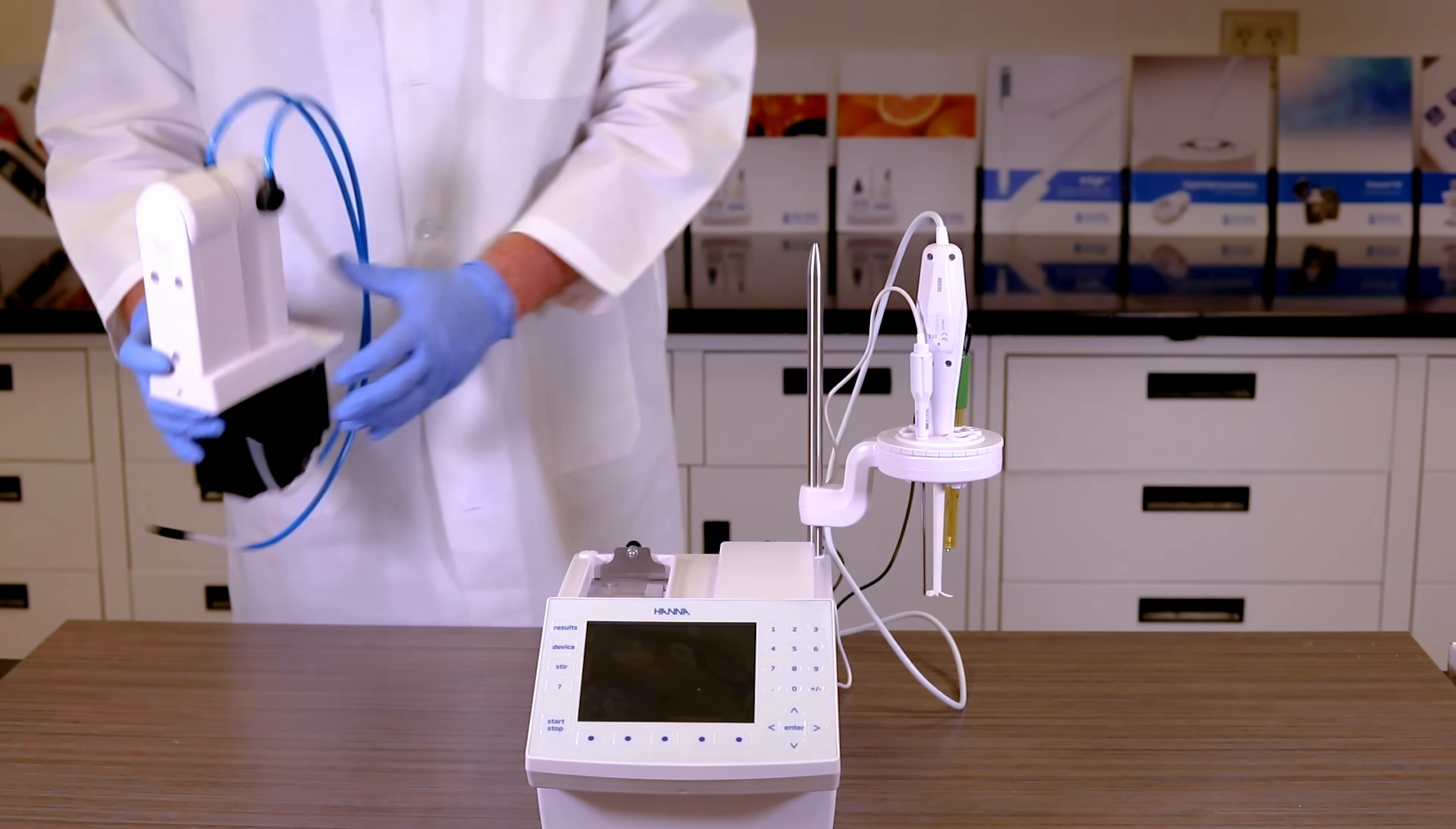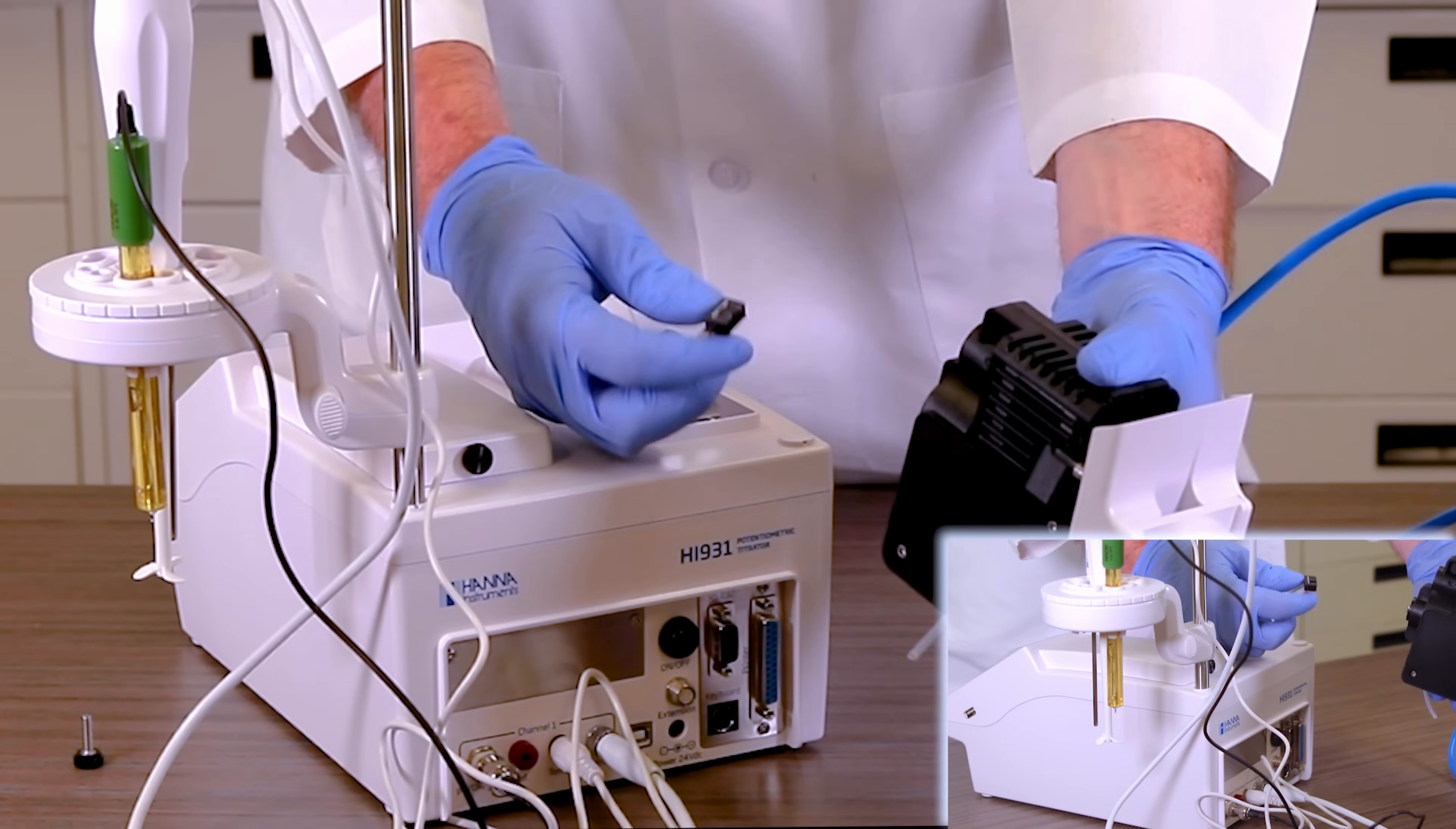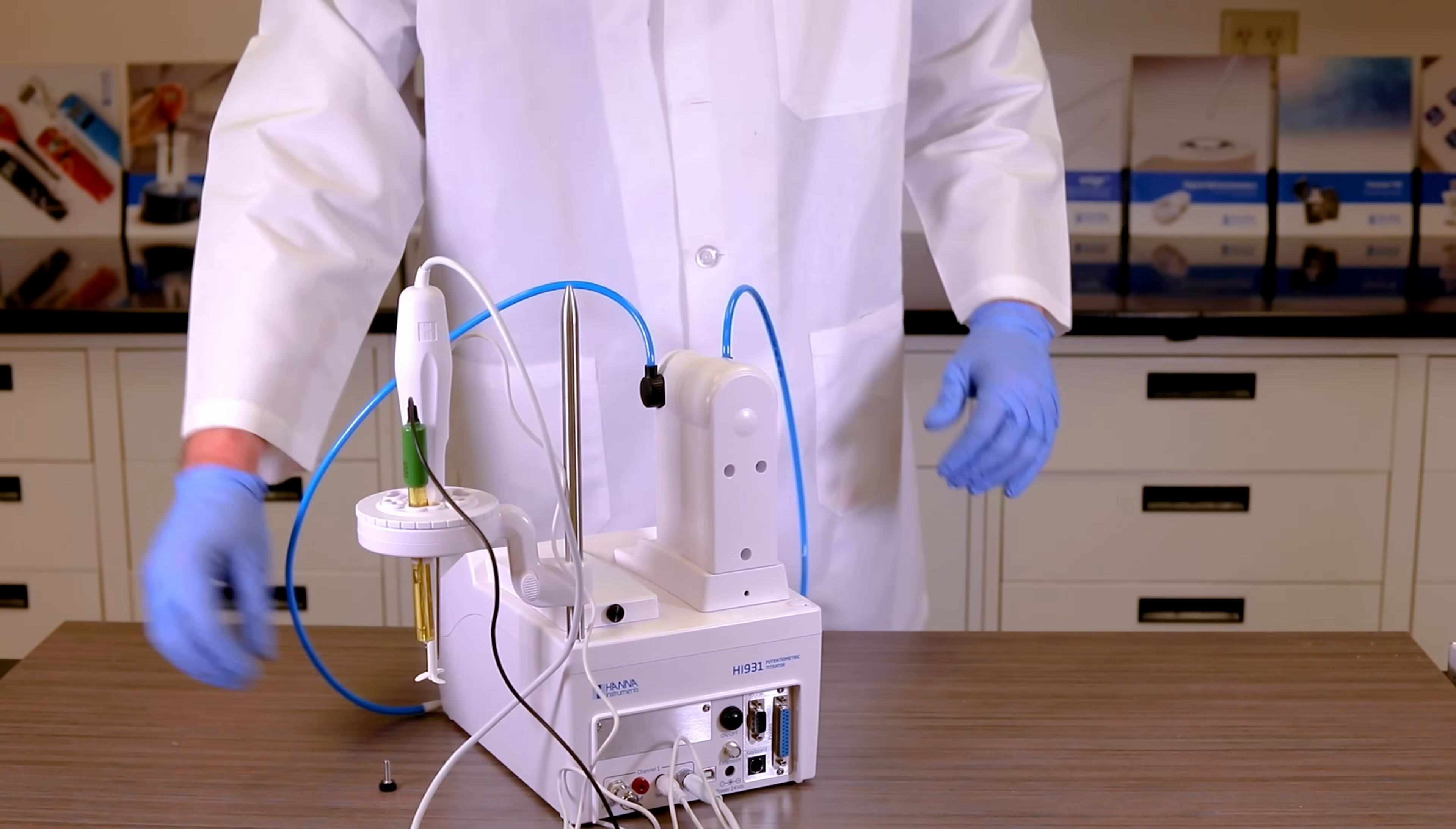Locate the pump assembly. Unscrew the pump cover and attach the ribbon cable to the pump. Set the pump into the well and tighten the screw located behind the pump.